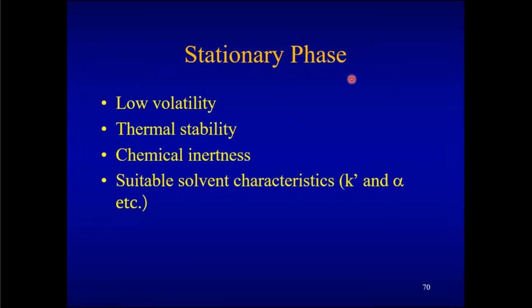So to summarize, the stationary phase should have low volatility, high thermal stability, chemical inertness, and suitable solvent characteristics, giving rise to K dash, that is the capacity factor, and separation factors of acceptable range.